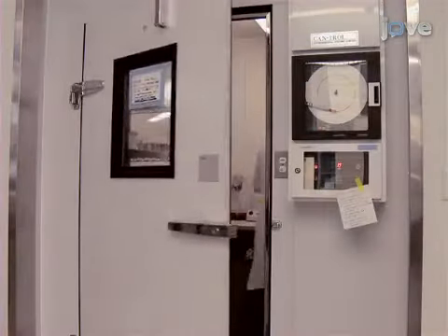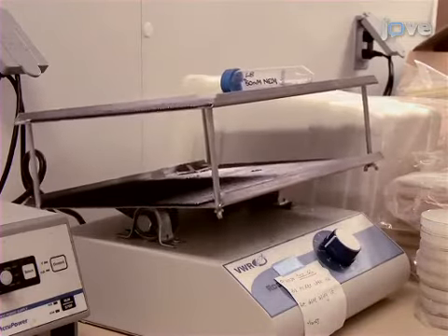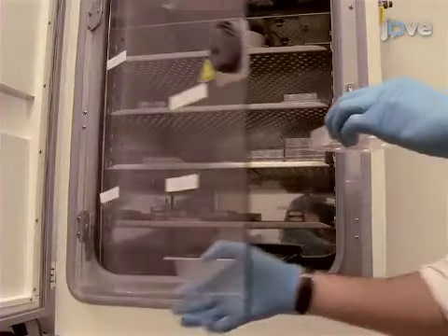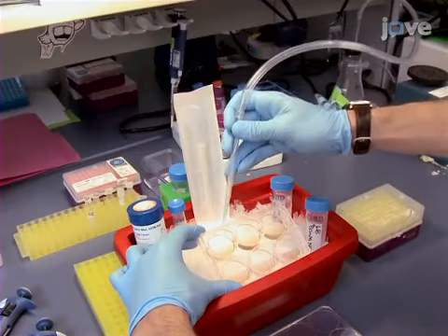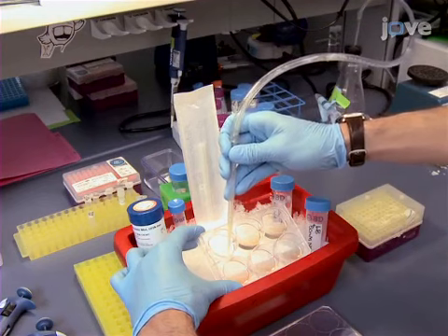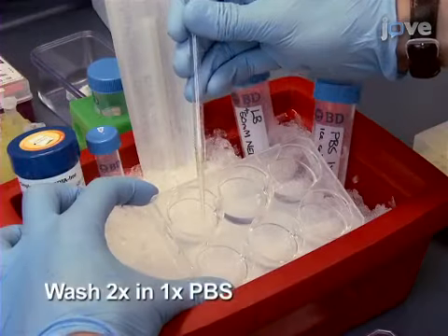In a 4 degrees Celsius cold room, quickly place the mixture on a rocking platform to fully mix for 5 minutes. Remove cultured primary rat hippocampal neurons from the incubator. Instructions on how to culture the neurons can be found in the text. After placing the cultured neurons on ice, gently remove the cellular media. Gently wash the neurons twice with cold phosphate-buffered saline.